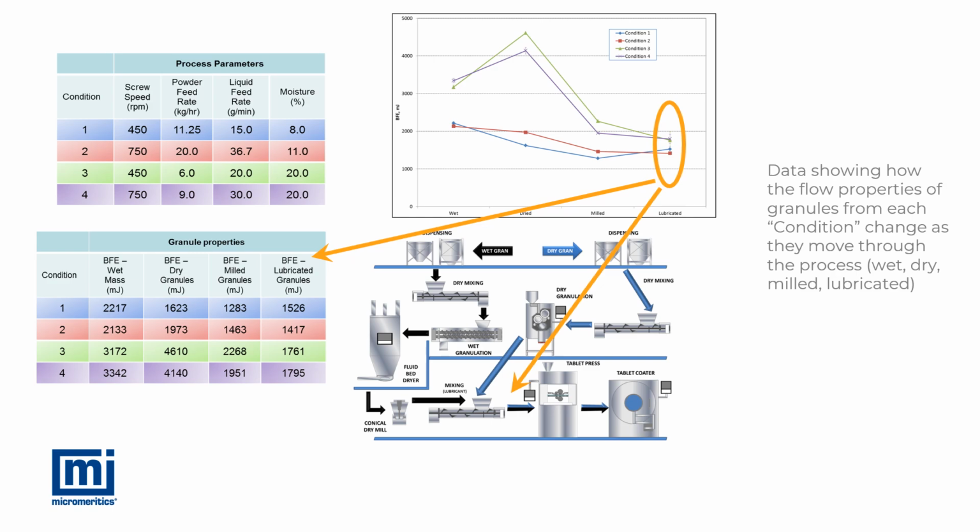So now we know that if we find a correlation between granule BFE and tablet hardness, then the best point to sample our granules to measure their BFEs is after the drying stage, where there is a good differentiation between each recipe.